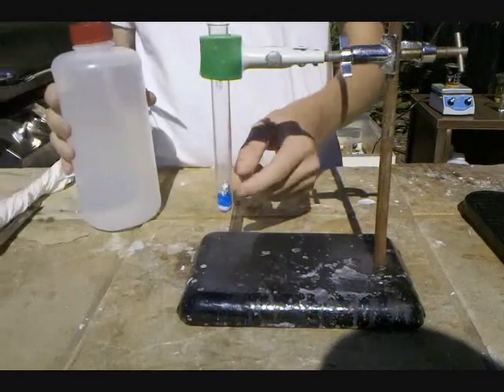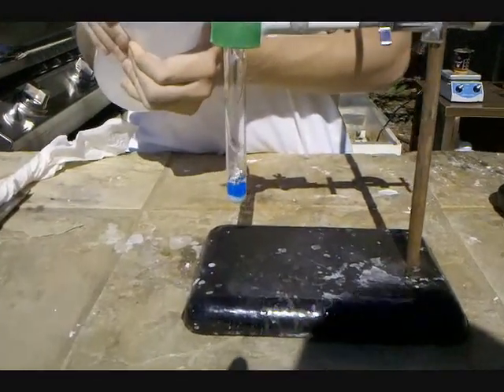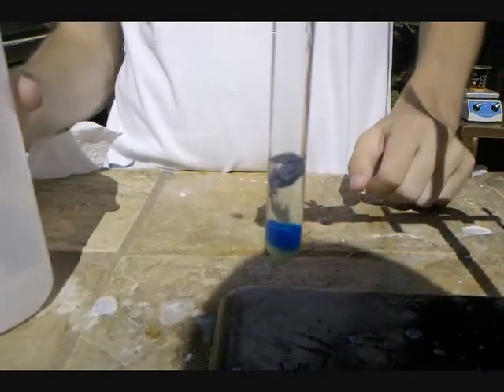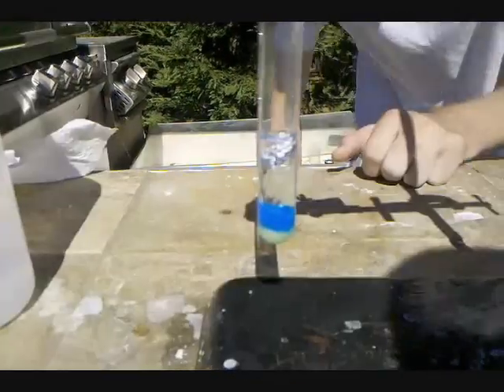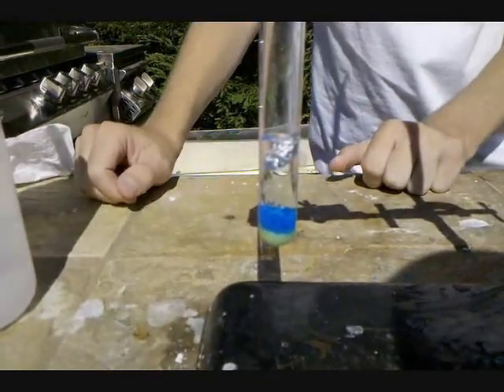So we'll add the aluminum on top of the copper sulfate and the sodium chloride, and add some water to dissolve. At first, no reaction will be seen because the salts need to dissolve.